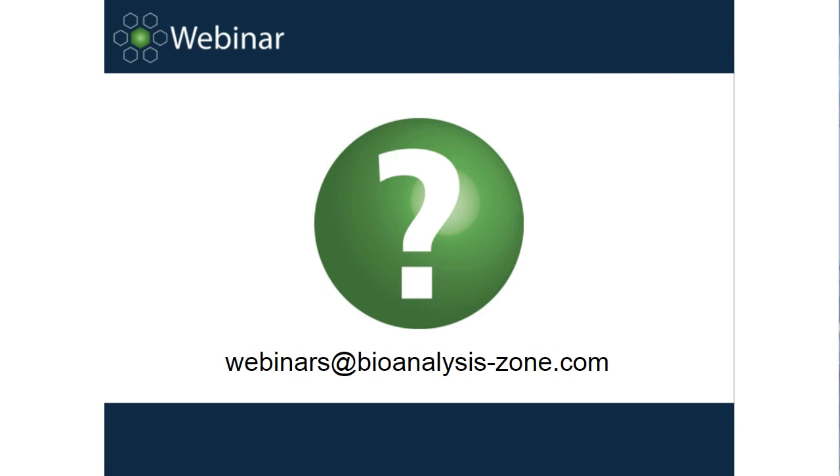It's a pretty good way, and the main reason we use it, is to stratify a large number of hits or consolidate a large number of hits down to a smaller number based on their off rate. And usually customers want us to select the clones with the slowest off rate because they're the highest affinity binders. So if they do work as capture antibodies, they will probably give you a better analytical sensitivity if they're higher affinity. But as I say, it doesn't guarantee their suitability as capture.